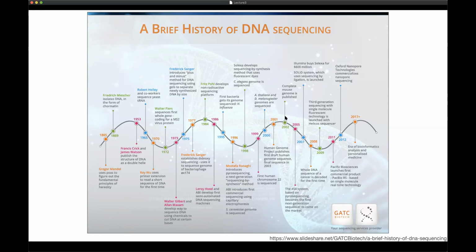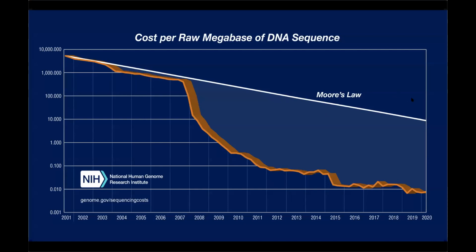And then in 2005, a fundamentally new technology was introduced. So this was the first massively parallel sequencer. And then it sort of took off. Then you have Illumina, which became and is the market dominant player at the moment, that got into this area in 2007, and so on. So this is all very rapidly developing. And the key points, the first modern sequencer was 1986. The next key point is 2005, where you had the first next generation sequencer. Now you have third and fourth generation sequencers. So this is progressing very quickly.